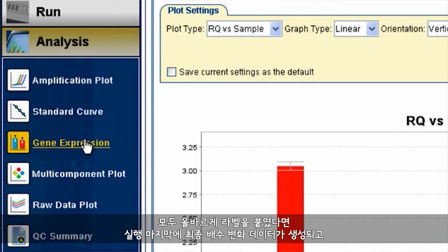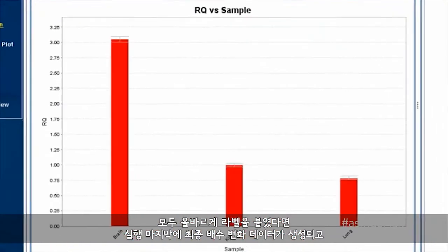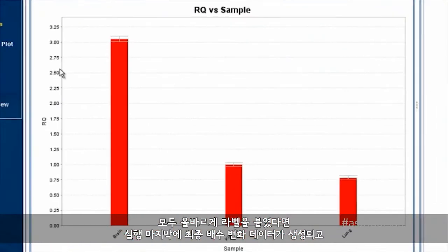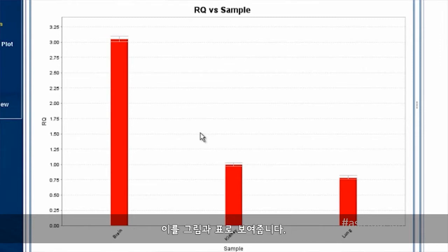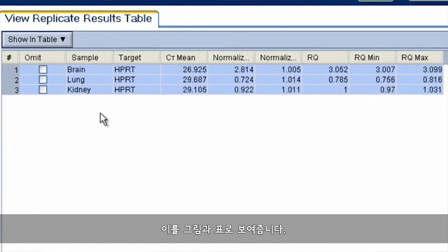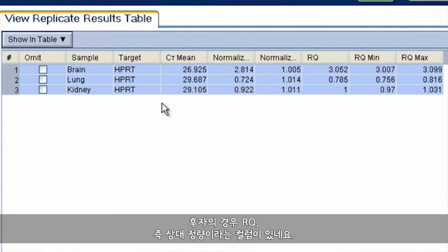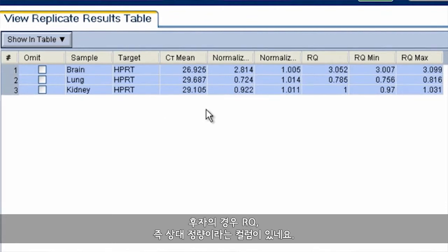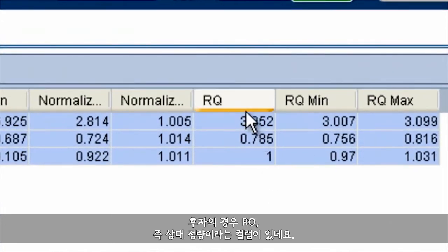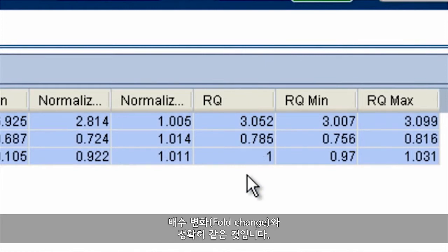If you labeled everything correctly, final fold change data will be generated for you and presented both in graphical and in tabular form. In the case of the latter, there's a column labeled RQ, or relative quantification, which is exactly the same as fold change.